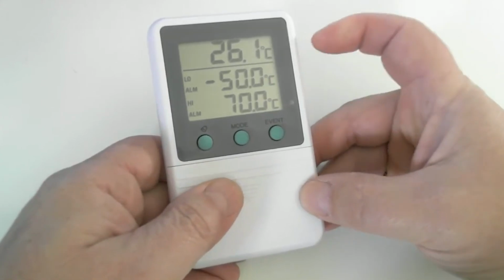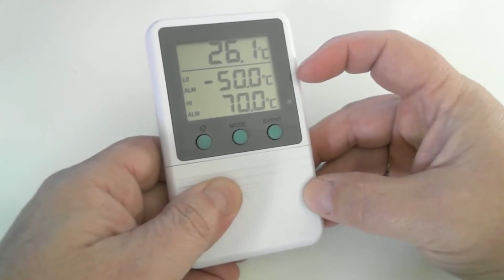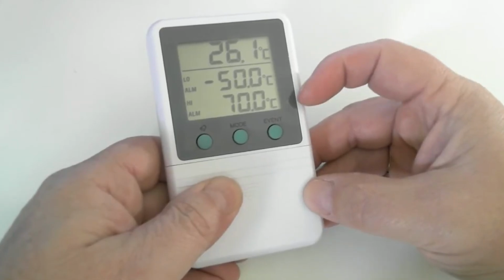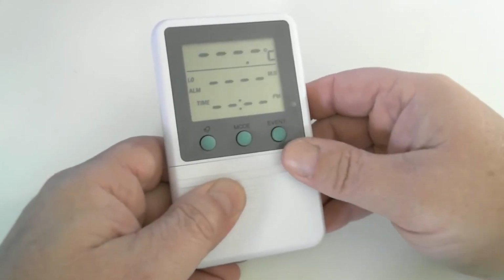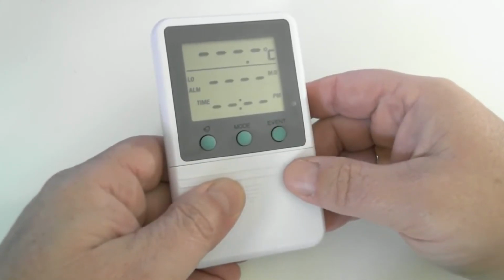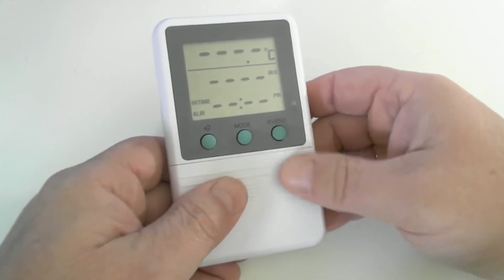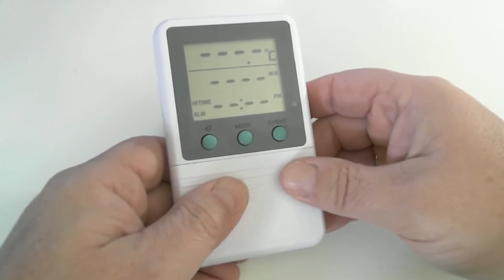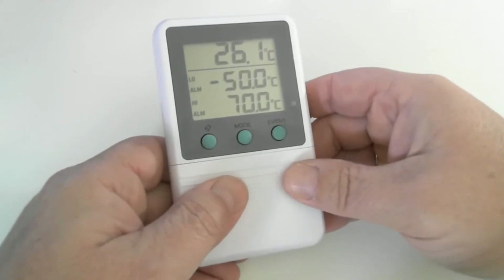It's currently showing the current temperature at the top, the low alarm set point, and at the bottom is the high alarm set point. If we press the event for this would show the low alarm time and date stamp, which we've not had an event, so there's no data. And pressing again would give us the high alarm data. Press event again, and we're back into the main alarm display screen.